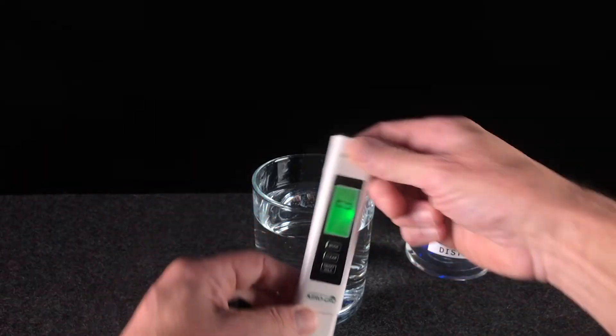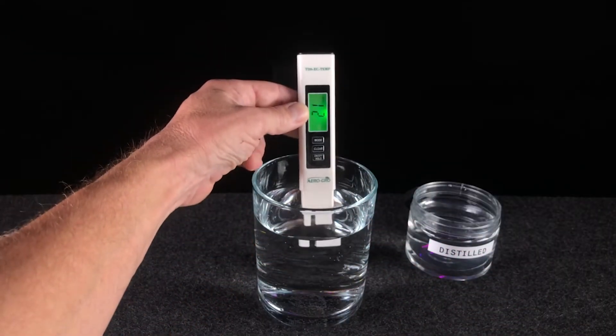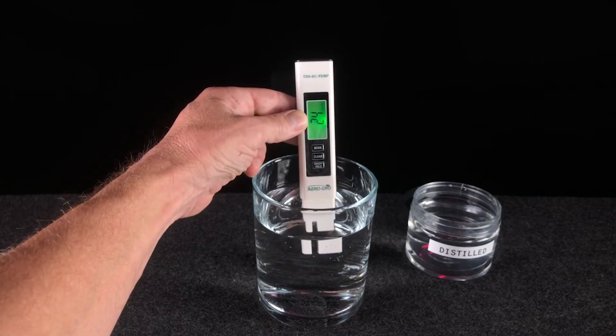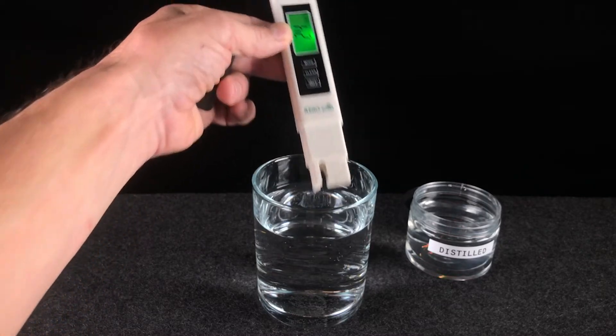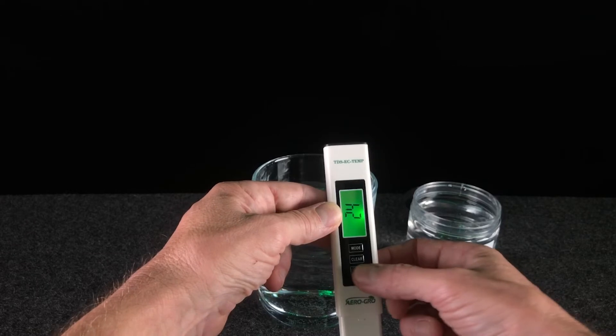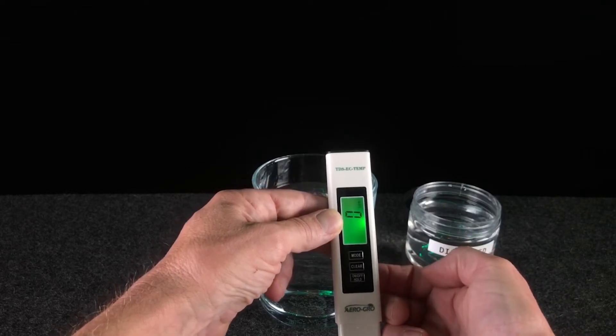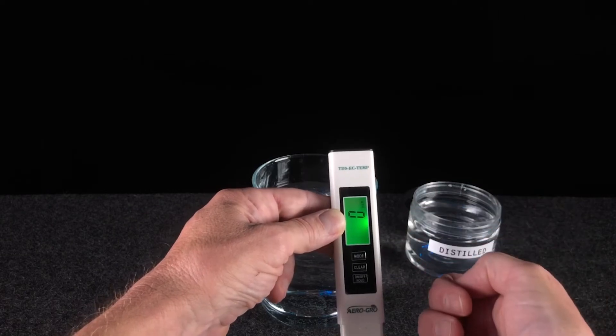So now when we want to take a reading, we'll simply dip it into the solution as usual, wait for four or five seconds. There you go. 24 parts per million is what this water measures. Now to clear that display, that's where we use the clear button. Clear. And it has now been recalibrated back to zero parts per million.